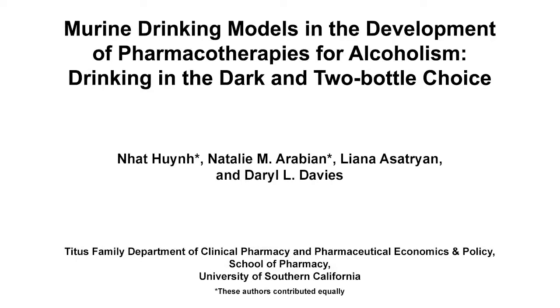The overall goal of this paradigm is to assess the effectiveness of a potential anti-alcohol drug using rodent models of alcohol use disorder. Alcohol use disorder represents a major public health crisis. Current treatments are ineffective and ongoing preclinical research is needed. Our protocol allows us to evaluate the safety and utility of a potential treatment, as well as to take a look at the underlying neurobiology of the disorder itself.